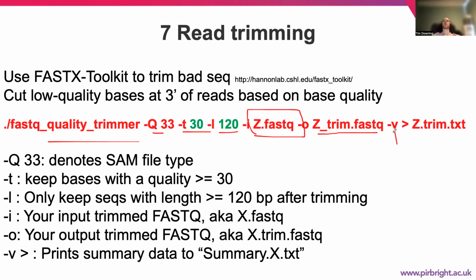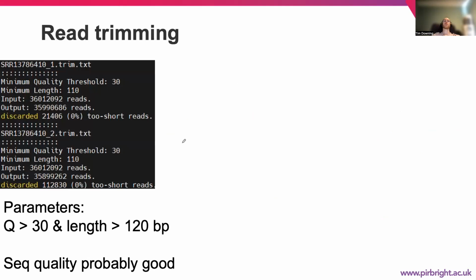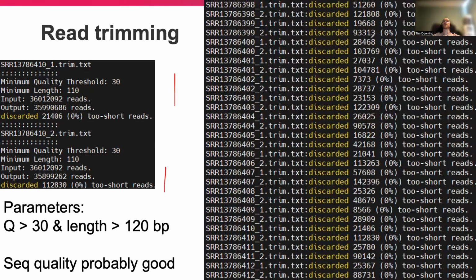And you can add some verbosity there, so you can send that to output as some sort of file containing the results of your trimming. What we'll find then later is that you'll remove some reads, but relatively few of them. Not too many per sample, and if you summarize across the different samples, you can see that there are different numbers for each particular one, but not too many are removed, indicating that the quality is good generally, which is reassuring.